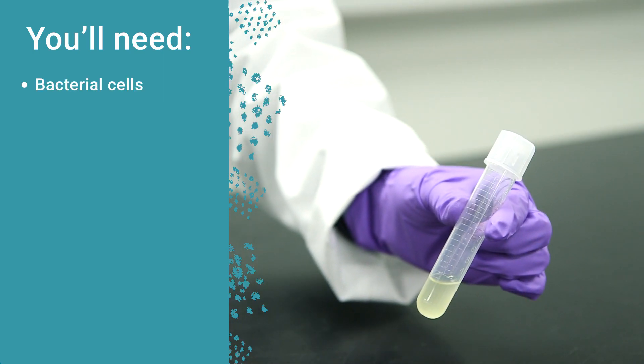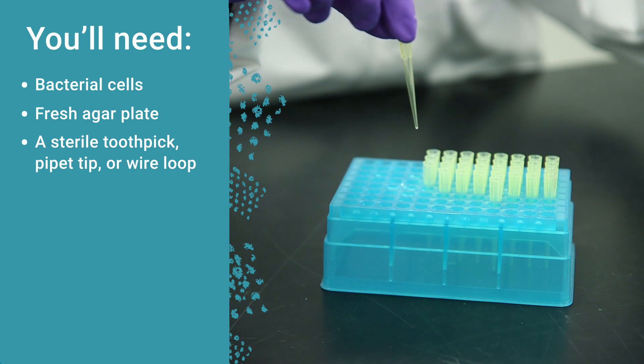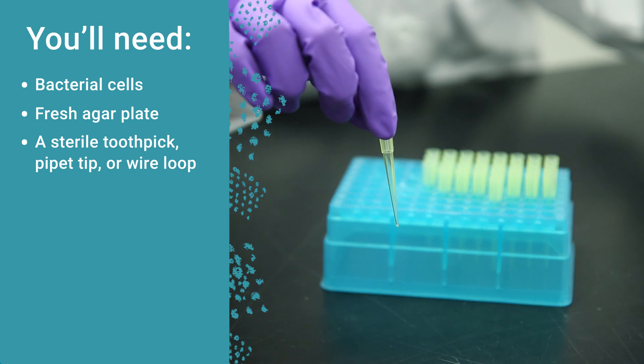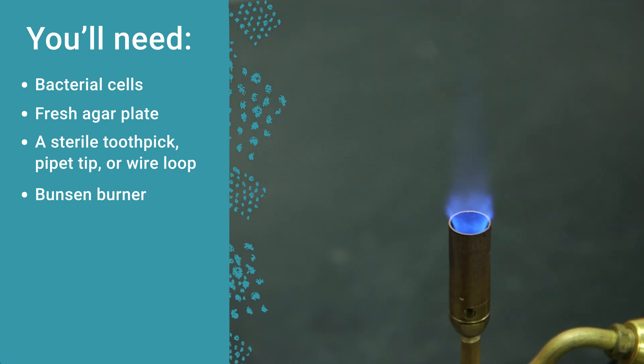To streak a plate, you'll need the bacterial cells you're plating, a fresh agar plate, and something to spread with — perhaps a sterile toothpick, pipette tip, or wire loop. If you're using a wire loop, you'll also need a Bunsen burner.